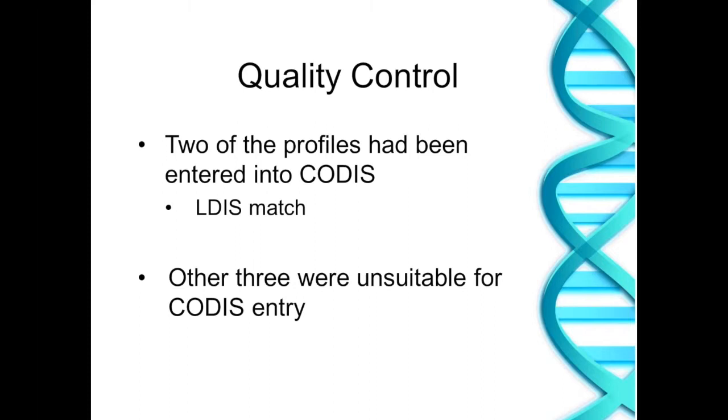But the bottom line for this investigation, at least, is that this is how we can use TrueAllele and the databasing process as a quality control mechanism, right?